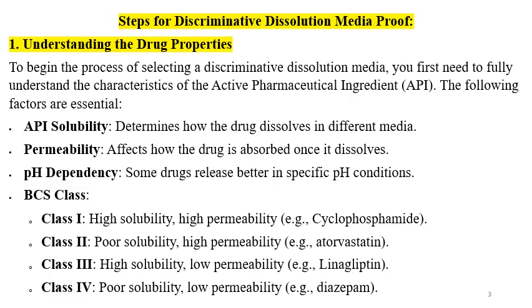Steps for discriminative dissolution method media selection, we should go step by step. Understanding the drug properties. So understand the drug behavior, its solubility, its BCS class. Understanding the drug properties is needed to begin the process of selection of discriminative dissolution media. You first need to fully understand the API characteristics like API solubility, how the API is soluble in different medias.